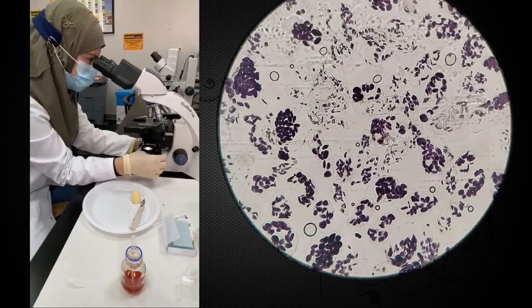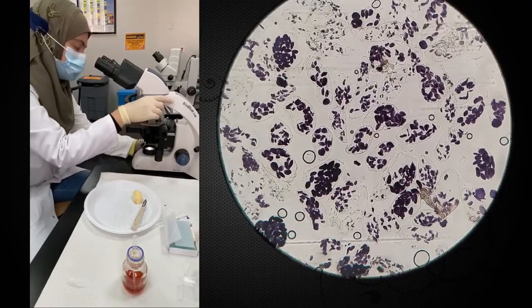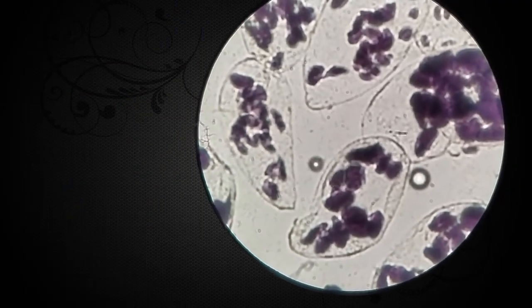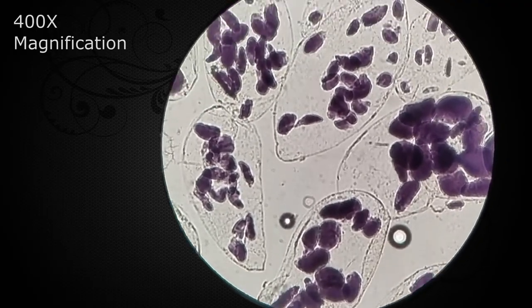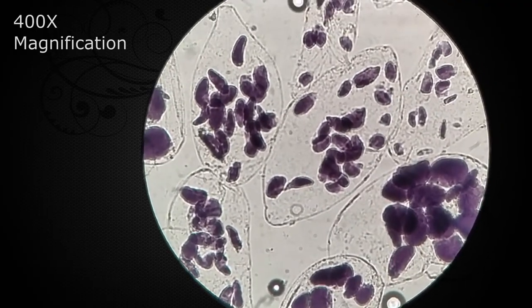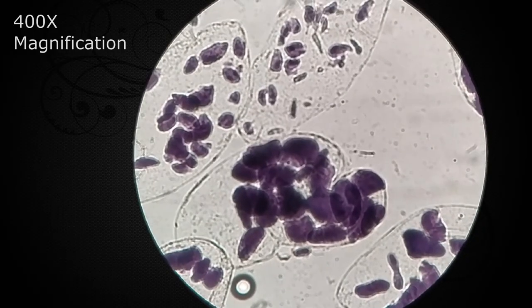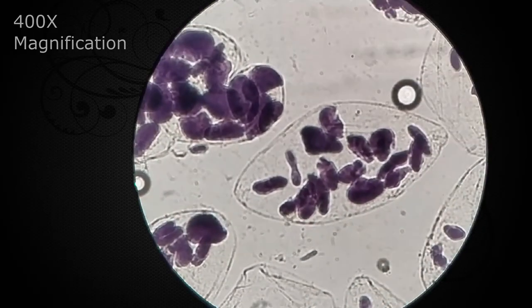Here I have some separated cells. They require more magnification. I can see in dark blue inside the banana cells the starch bundles, and if you search nicely, some of the cells would show the nucleus. I'll take a picture of this and also post it.